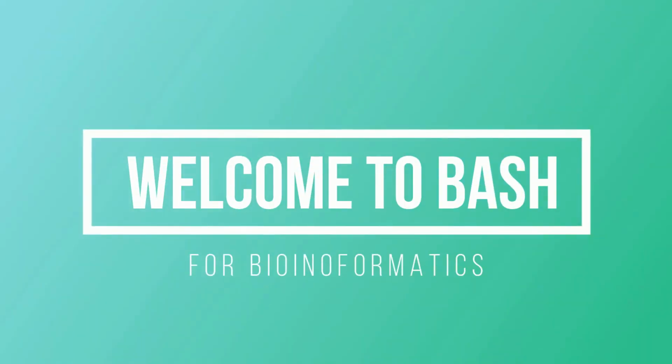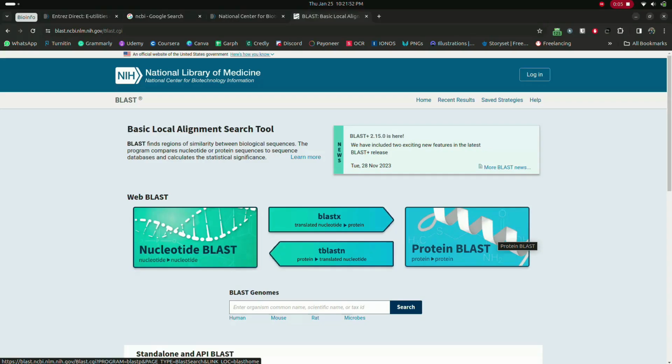So, if you guys are working in bioinformatics, you should be familiar with BLAST, Basic Local Alignment Search Tool. So, welcome to the new lecture. In this lecture, we are going to learn about BLAST and using it on command line interface.